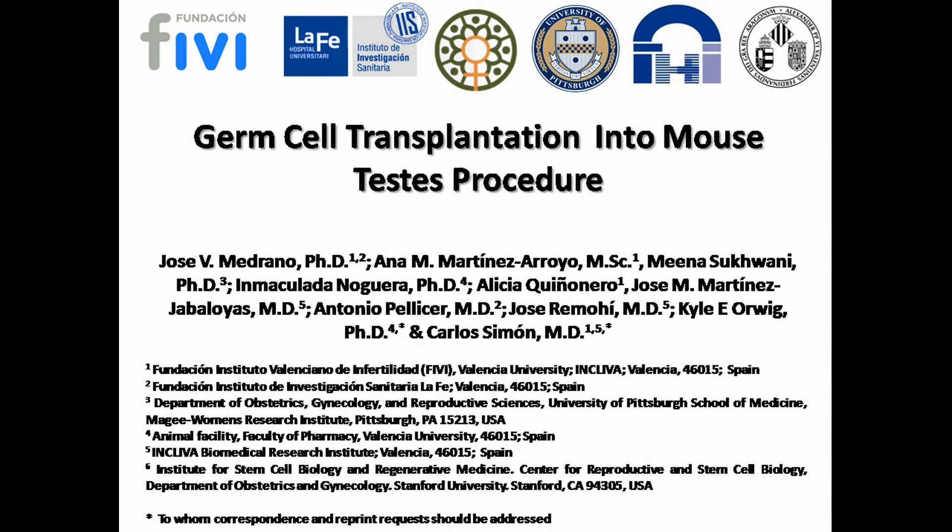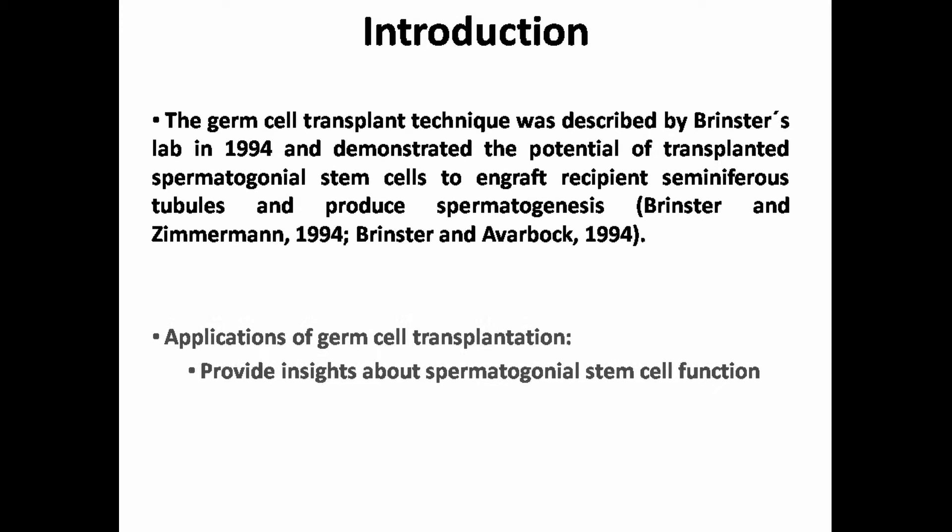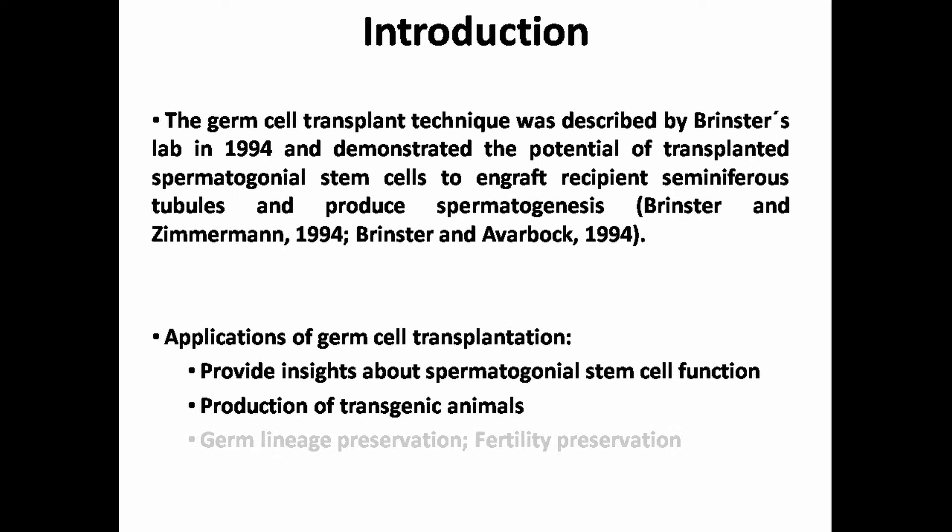In this video, we describe a step-by-step procedure for germ cell transplantation into mouse testis. The germ cell transplant assay was first described by Dr. Ralph Brinster's lab in 1994 and demonstrated that transplanted germ cells could engraft the testis in infertile recipient mice and produce spermatogenesis. Germ cell transplantation can be used to obtain fundamental insights about spermatogonial stem cells, to produce transgenic animals by genetically manipulating donor cells prior to transplantation, and may also be used to preserve the germline of valuable animals or to preserve human male fertility.